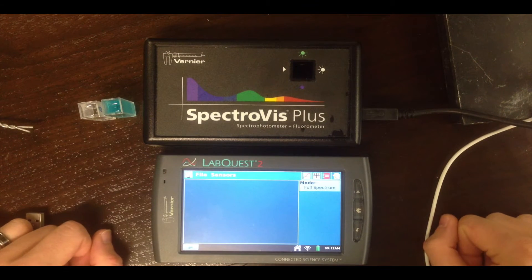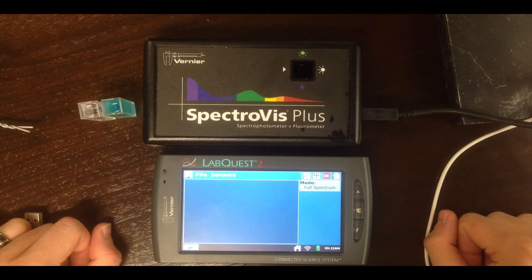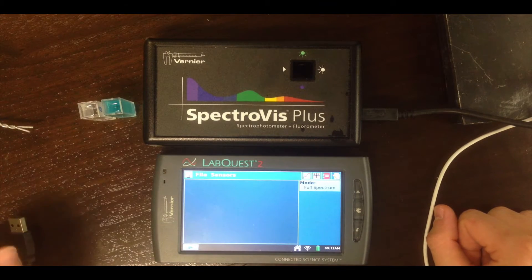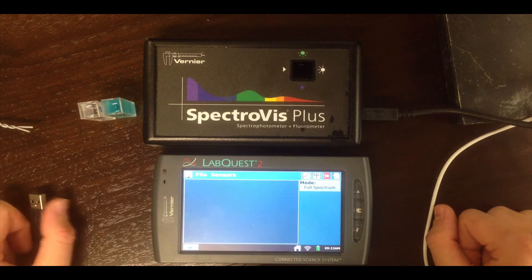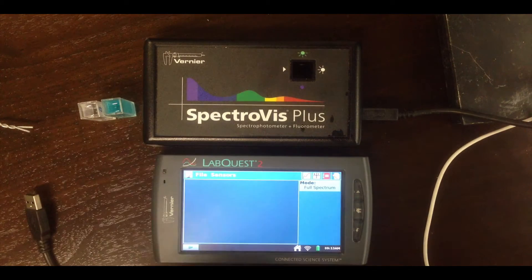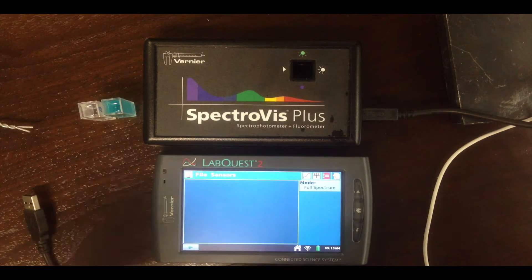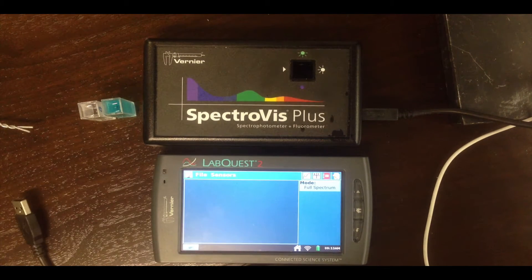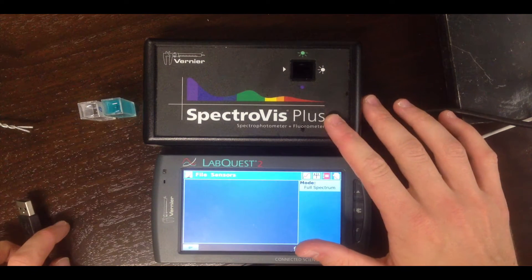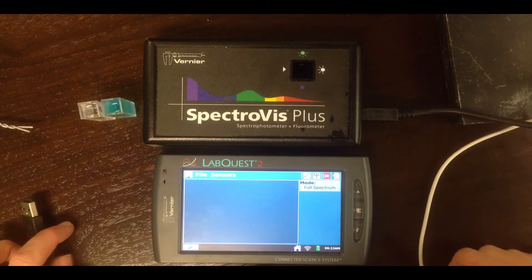Hi guys, Dr. Evans here with another LabTips video. This one is on using a LabQuest and SpectroVis spectrometer to record a visible absorbance spectrum for a colored solution. The idea is we want to understand how the colored component of a liquid solution responds to light — for different wavelengths of light, does the solution absorb that wavelength? That's what's measured by absorbance spectroscopy. The device to do this is called a spectrometer, and the brand we'll use is called SpectroVis.